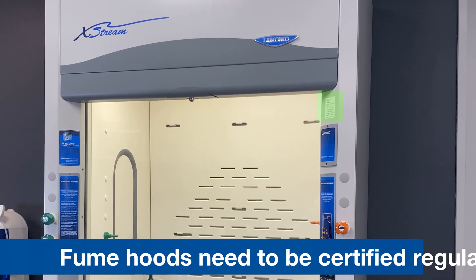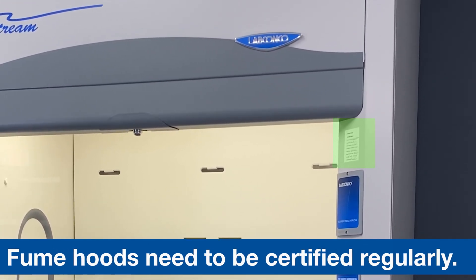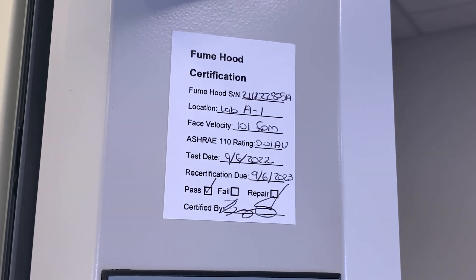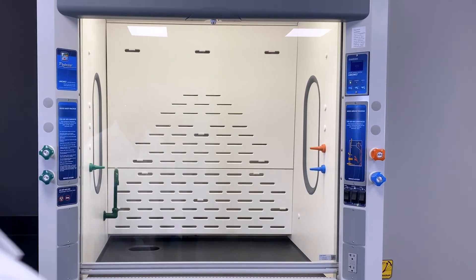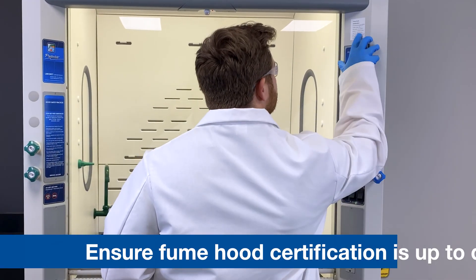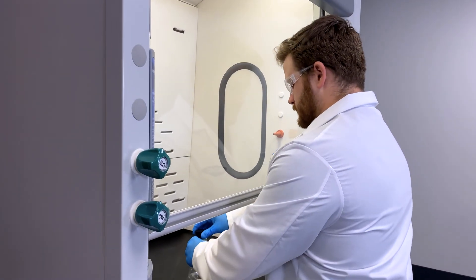Fume hoods need to be certified regularly to validate proper functionality and will often feature a certification sticker clearly visible on the front fascia. If your fume hood is past the date for recertification, stop any work inside the hood until it has been tested and recertified by the proper authority.